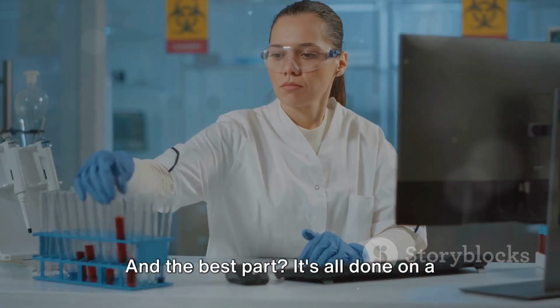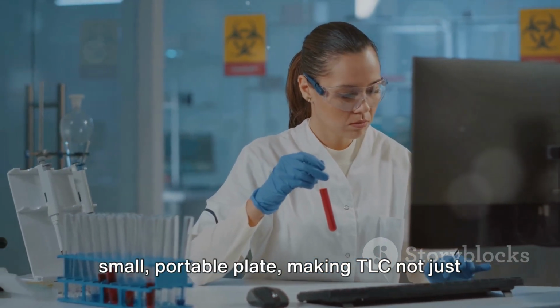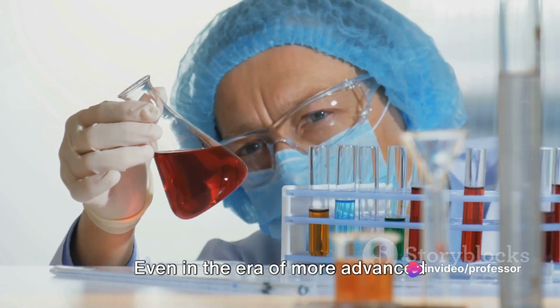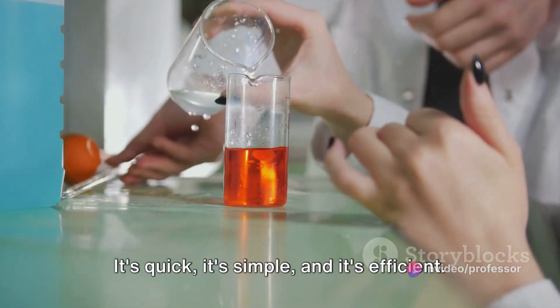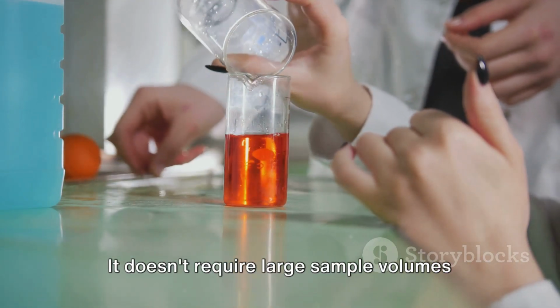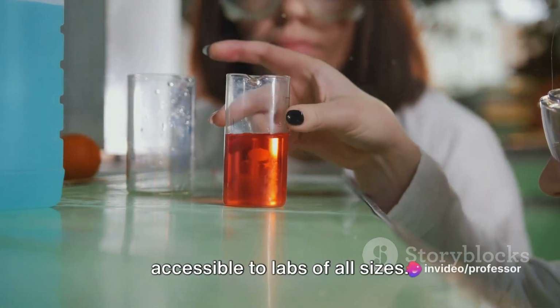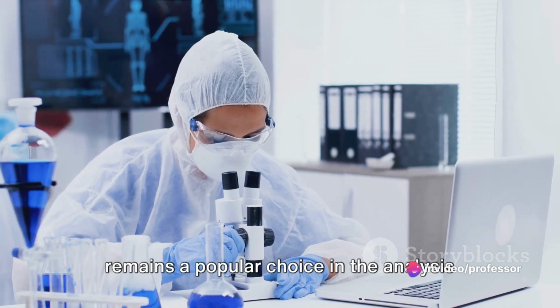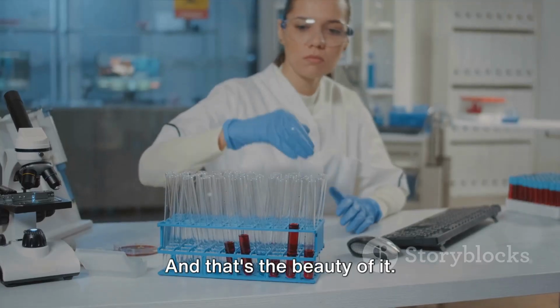And the best part? It's all done on a small, portable plate, making TLC not just effective, but also highly convenient. Even in the era of more advanced techniques, TLC holds its ground. It's quick, it's simple, and it's efficient. It doesn't require large sample volumes or expensive equipment, making it accessible to labs of all sizes. TLC, with its ease of use and efficiency, remains a popular choice in the analysis of plant compounds. And that's the beauty of it.